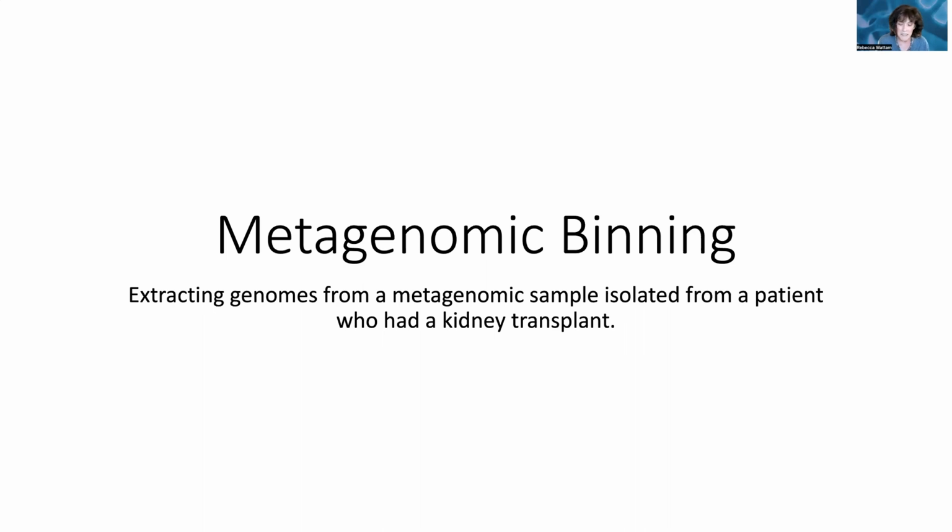And you can use this if you have a contaminated sample that you don't want to have to go back to the lab and re-isolate again, but also you can use it for a mixed sample, like something you get from wastewater or from a clinical sample that you're trying to figure out what's there. The example we're going to use is that same one we've been doing, which was a metagenomic sample from that patient who had had a kidney transplant.